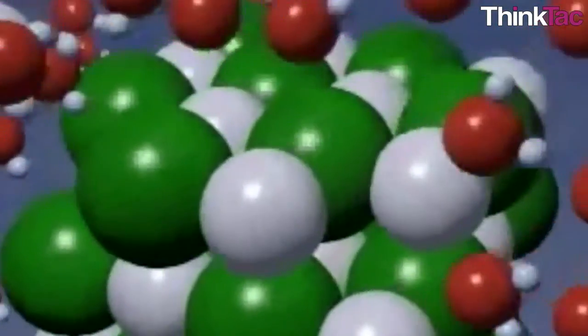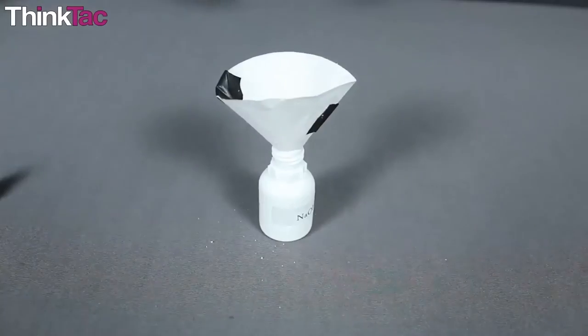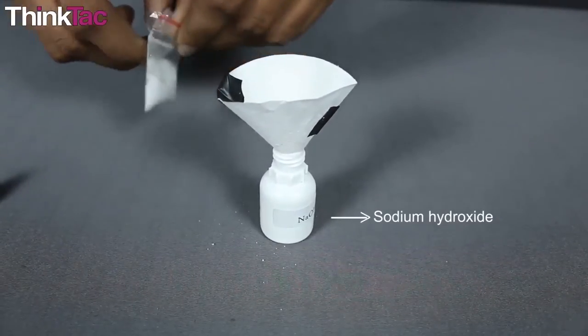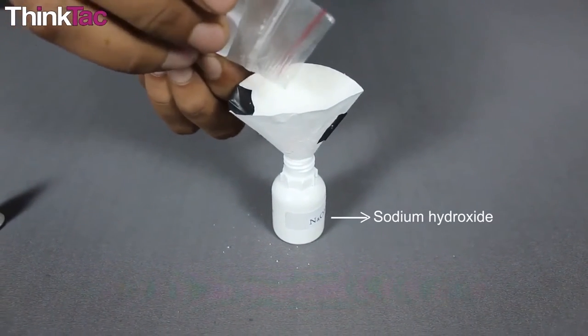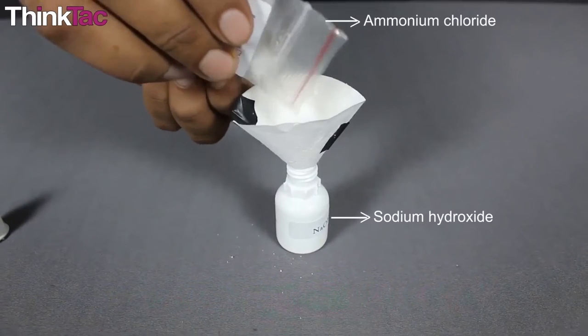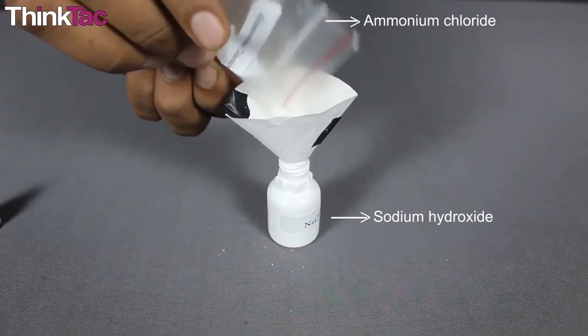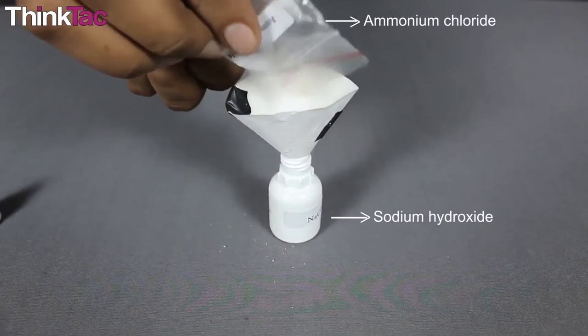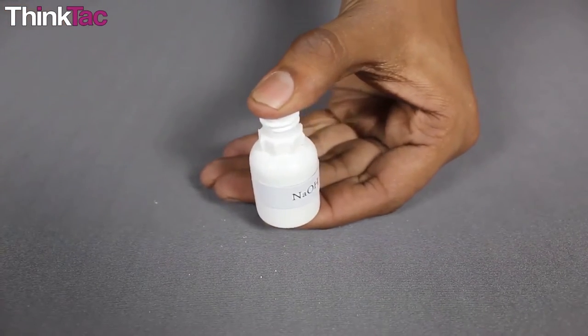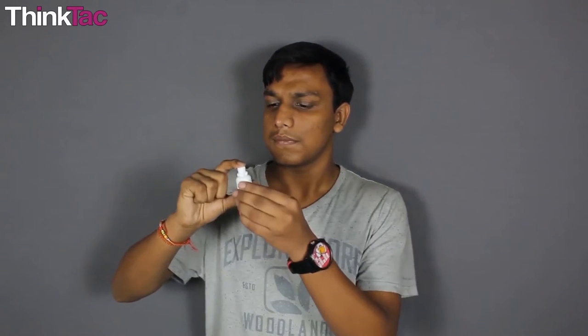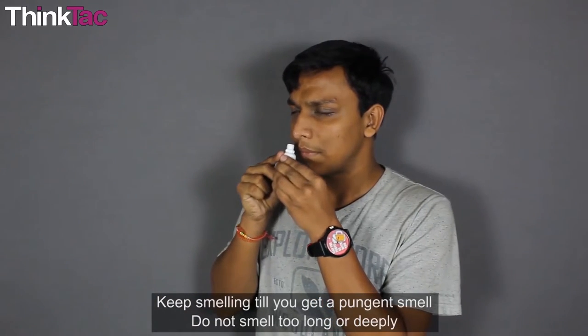Now coming back to the main topic about your experiment: reaction between sodium hydroxide and ammonium chloride. This is an endothermic reaction where heat is not produced but is rather used for the reaction to take place. This reaction also happens to be an example of a double displacement reaction, and it is a reaction that has a couple of strong physical characteristics as well. You get to smell the strong pungent repulsive odor of ammonia.